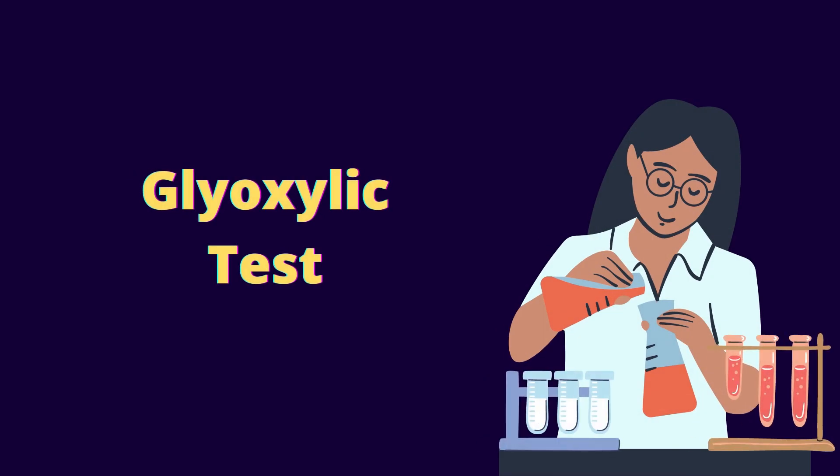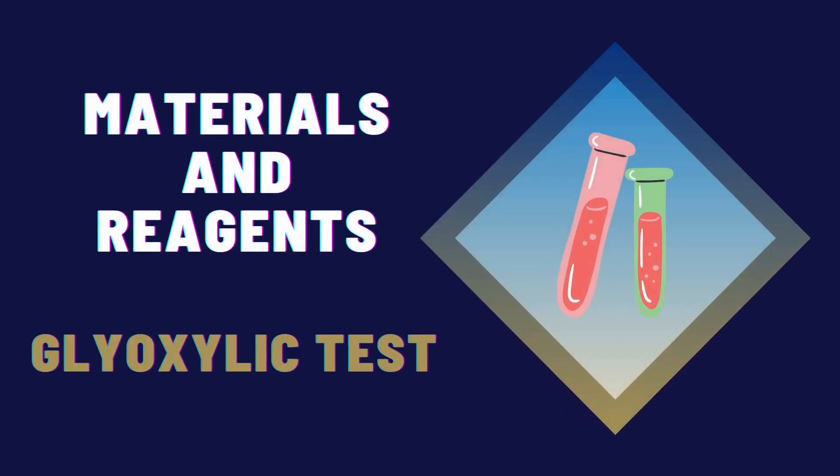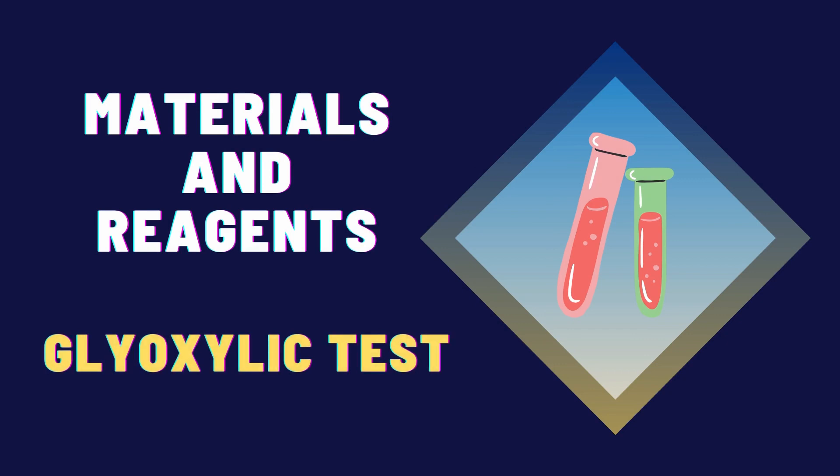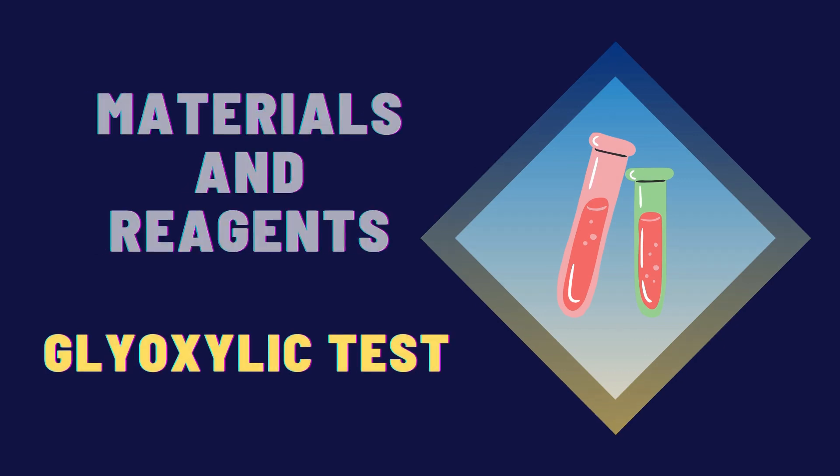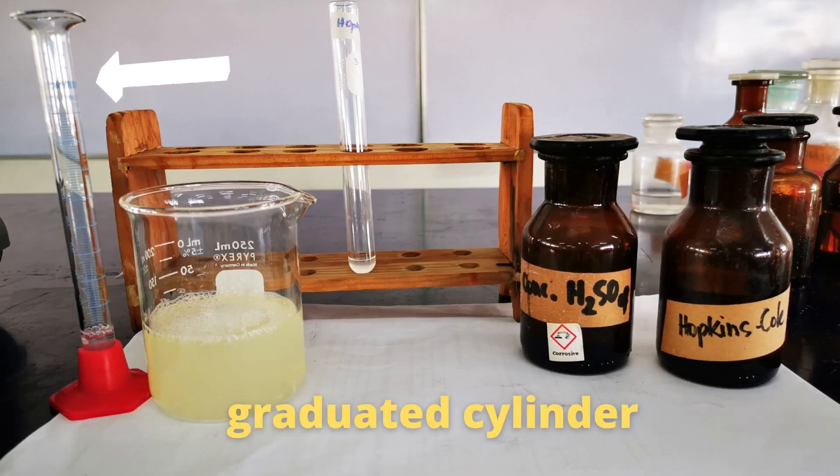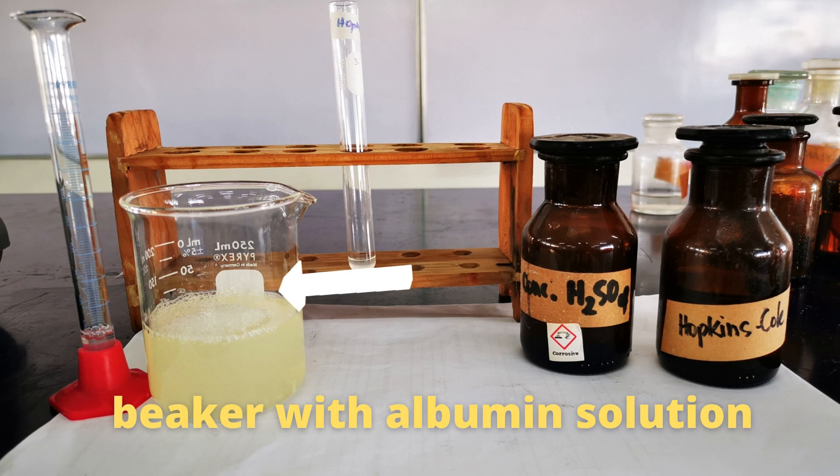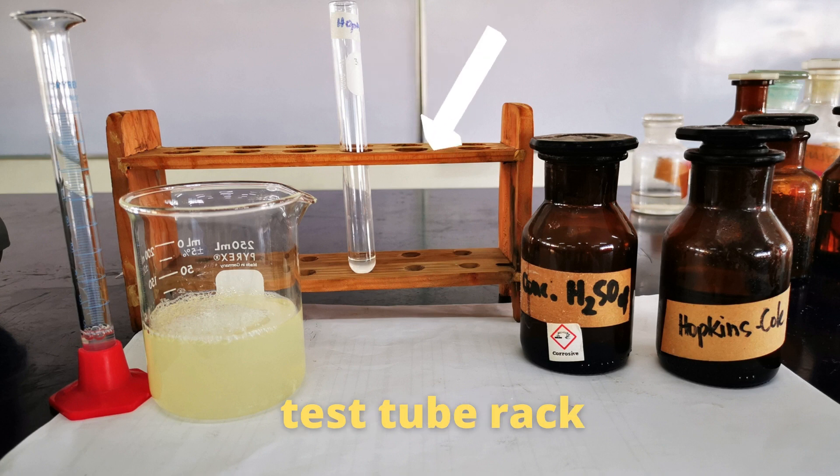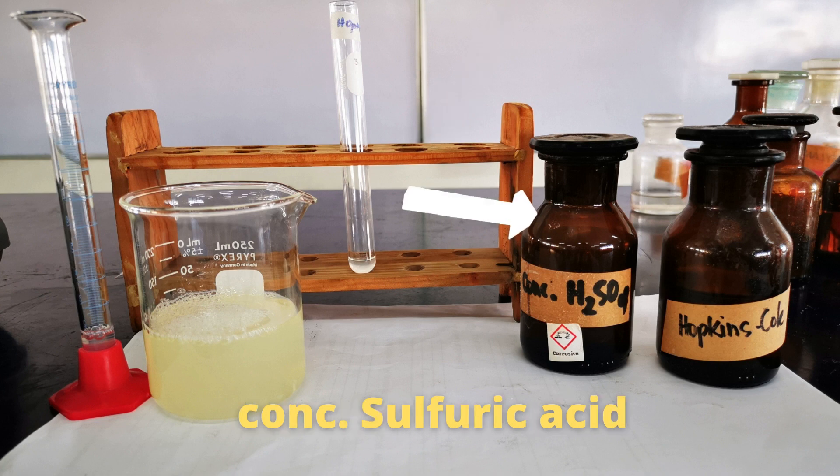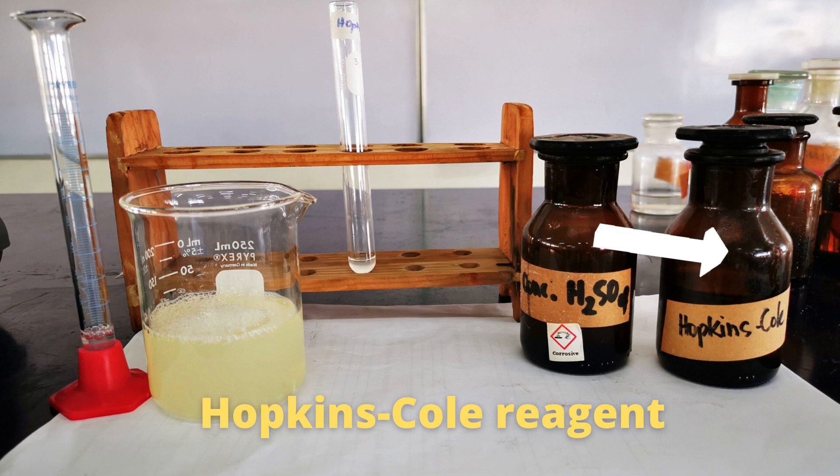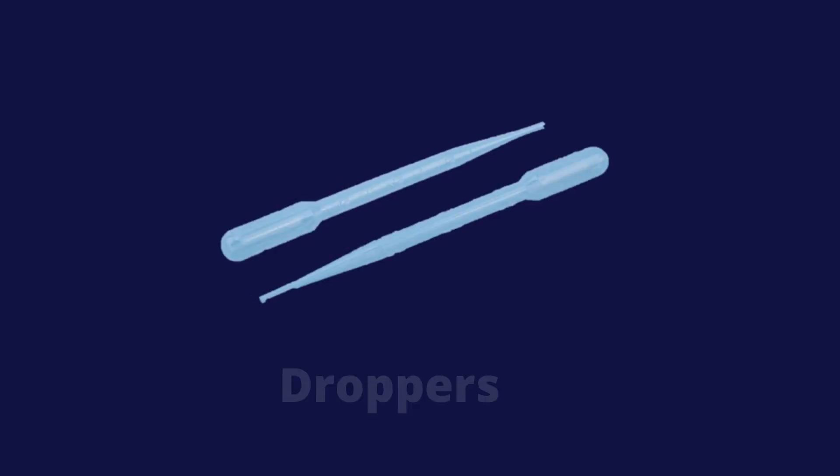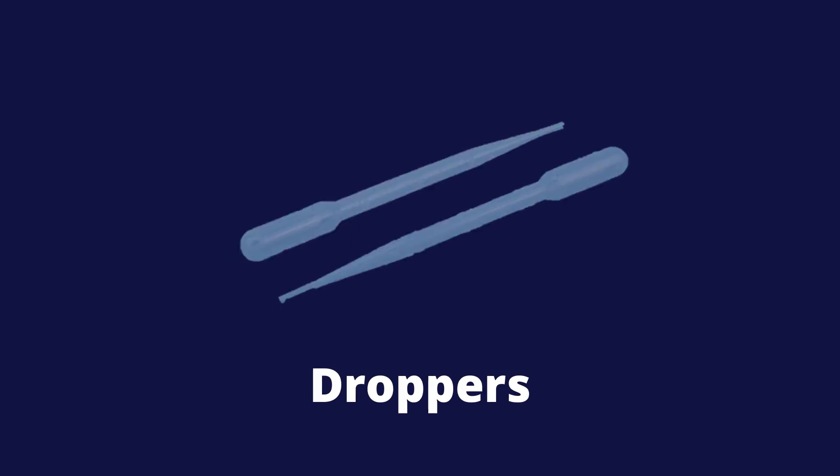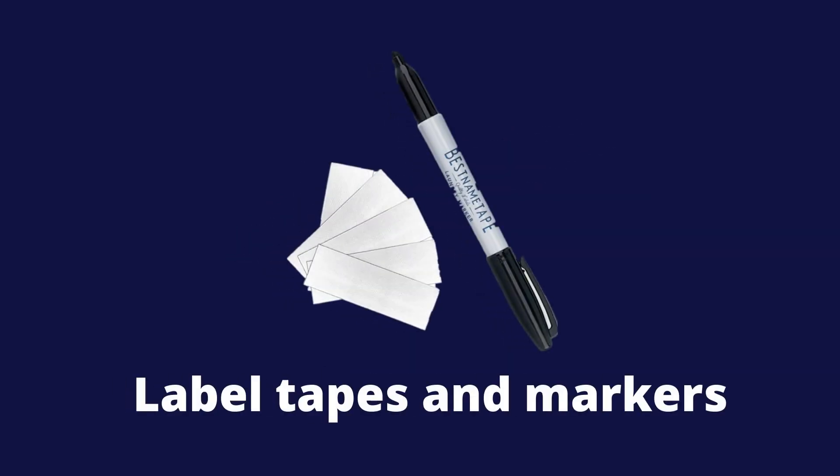Next, we have the glyoxylic test. These are the materials and reagents for glyoxylic test: graduated cylinder, beaker with albumin solution, test tube, test tube rack, concentrated sulfuric acid, Hopkins Cole reagent, droppers, and label tapes and markers.